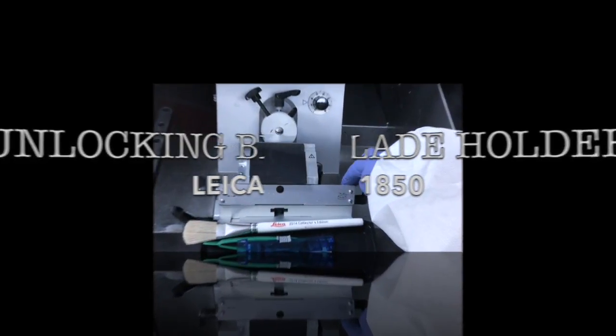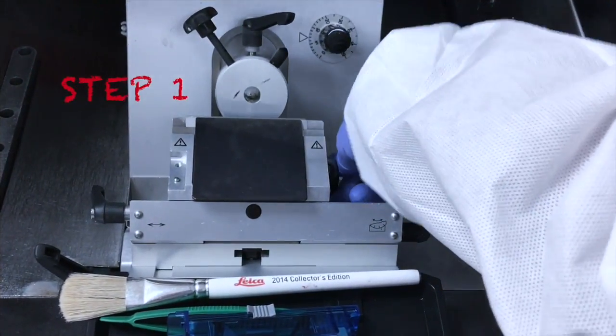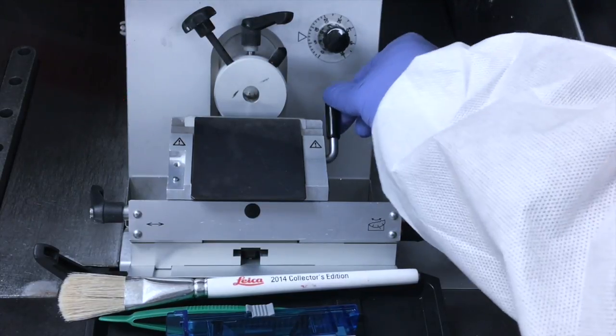Unlocking blade holder for the Leica 1850. Step 1. Pull rubber tipped blade clamp lever on right side towards you.